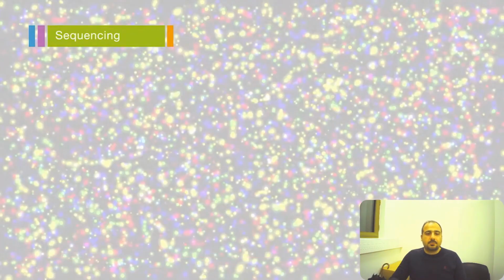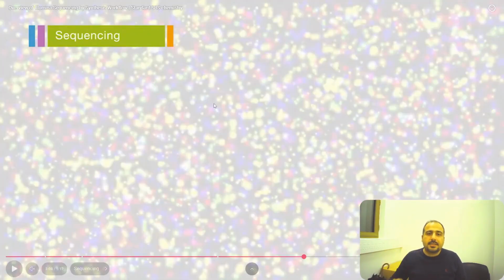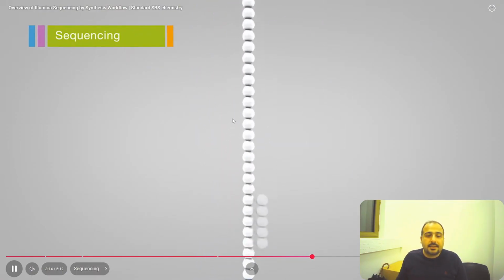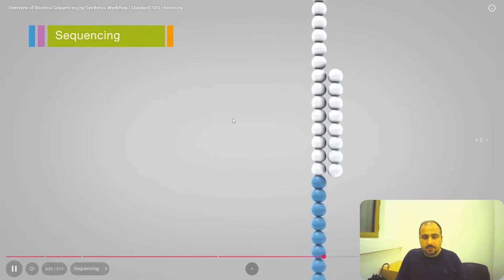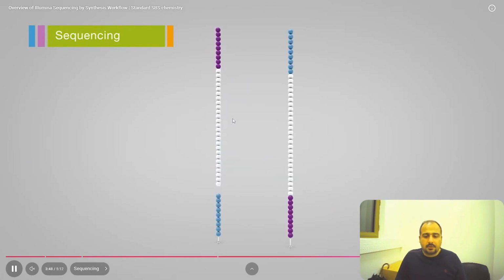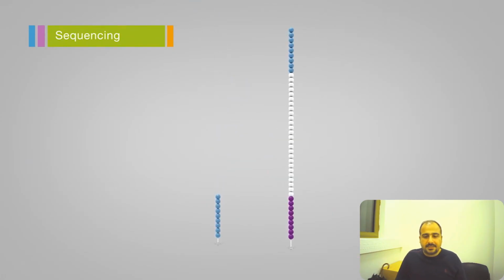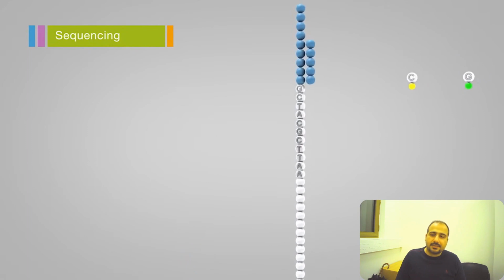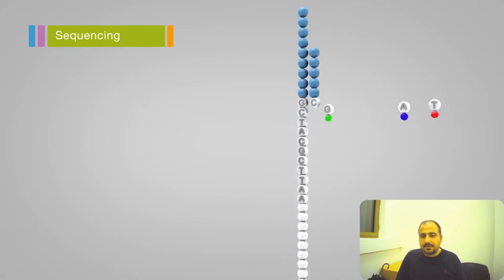With the successive exposures taken one after another, you can see which bases are present at that point, or in other words, in that read. I'll skip over these parts. These sections of the video that you're seeing aren't really important at all. For now, you can leave these for later when you get to the main stages of sequencing, and once you become proficient in the analysis, you'll gradually learn those steps. Don't worry.